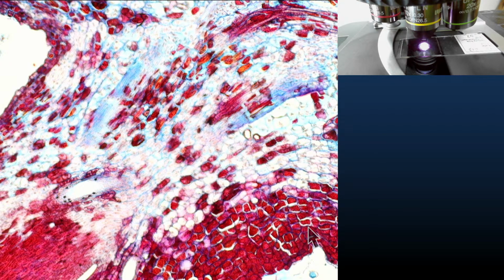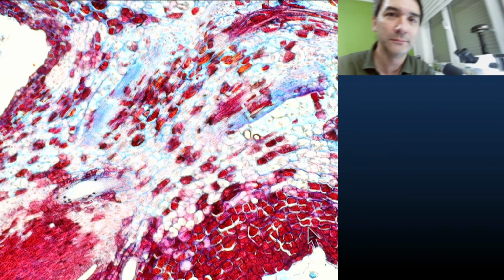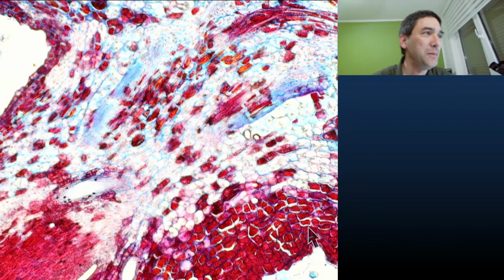But I'm a little bit frustrated now myself because I cannot make the thing reappear. How do you call this? An emergency solution. Look what I'm doing right now. I think this is going to be. Is this going to be the?